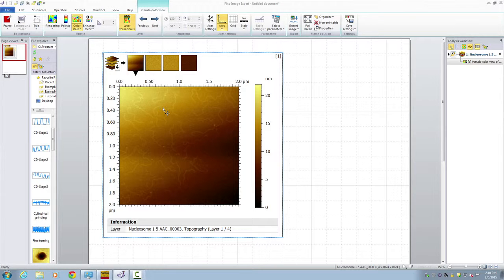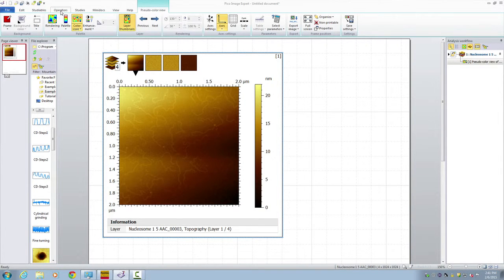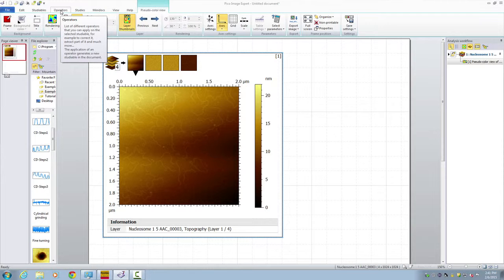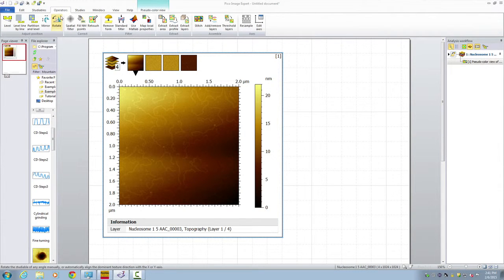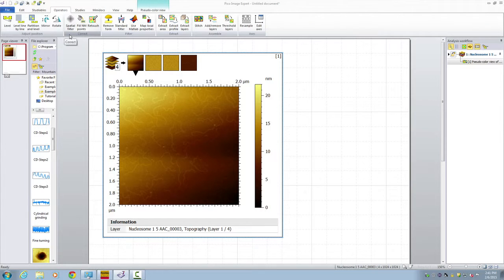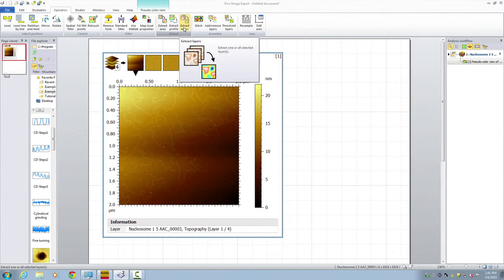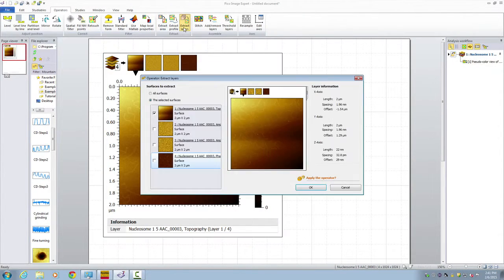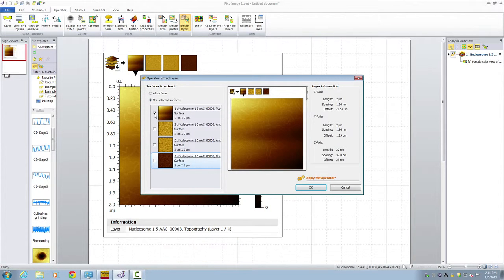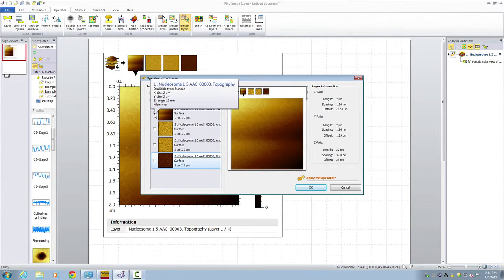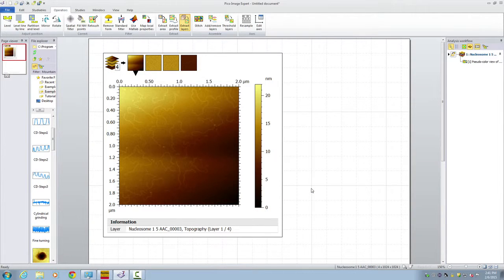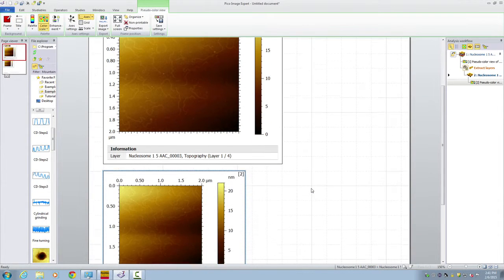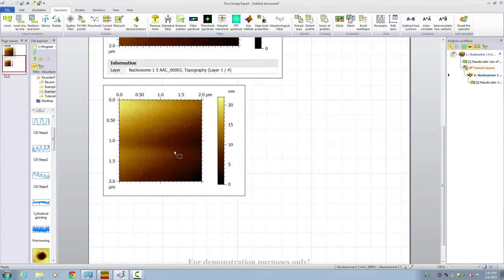So step number one is extract the first page of topography so we can do some processing on it. Let's go to operators and then extract areas, extract layers. Choose the layer you want to extract. In this case it's a topography image. Click OK. And then we have the single page topography image.